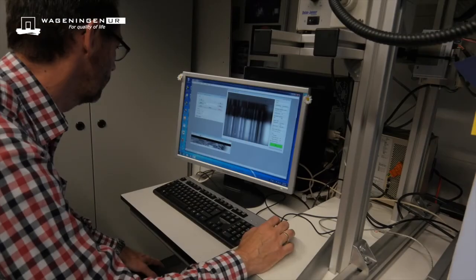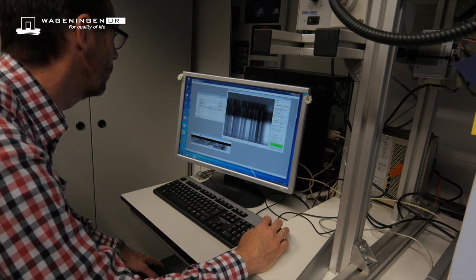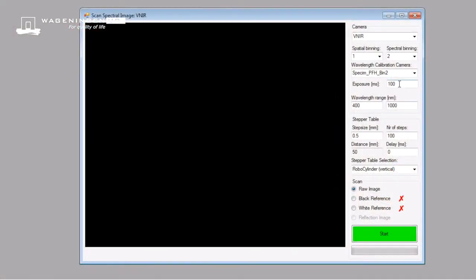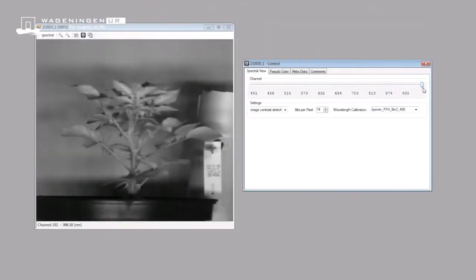To scan a full spectral image, the exposure time and wavelength range are set. The acquired spectral image is displayed on the screen.